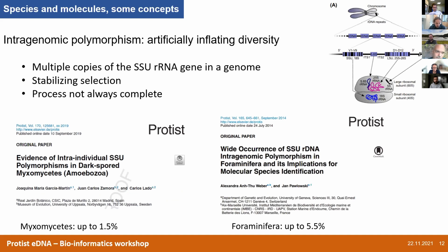Another problem is intragenomic polymorphism. This issue is particularly important with groups that have very long SSU sequences, like the foraminifera, where we can find that within a single genome you can have differences of up to 1.5% between copies — and even up to 5.5% difference within a single foraminiferal cell. This may cause a lot of overestimation of diversity.